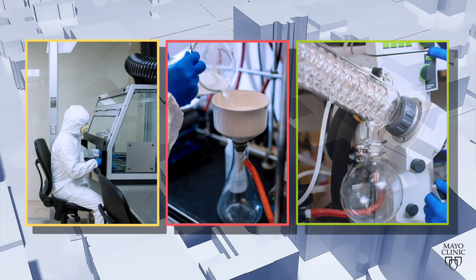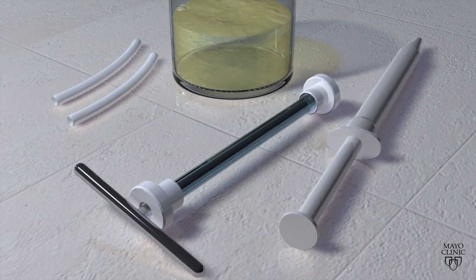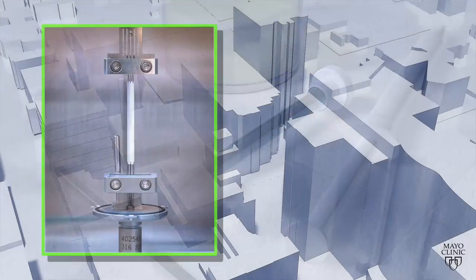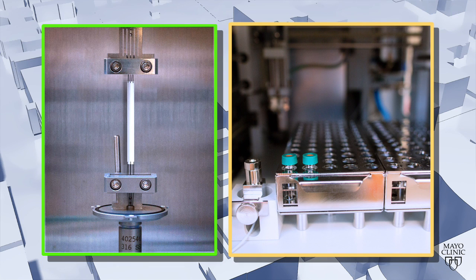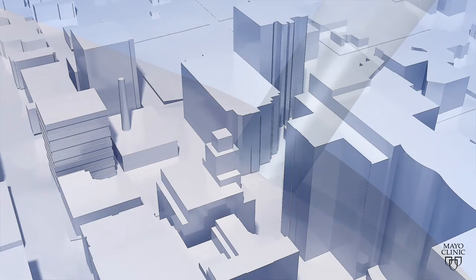A nerve scaffold that will support axon growth is fabricated in the biomaterials clean room from a novel biodegradable polymer. It is tested for tensile strength and biodegradability. In the future, cells will be added to the scaffold to repair long nerve gaps.